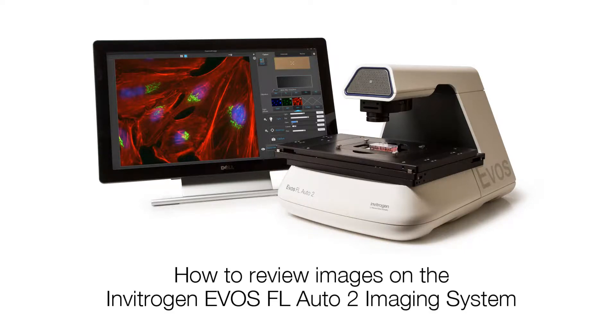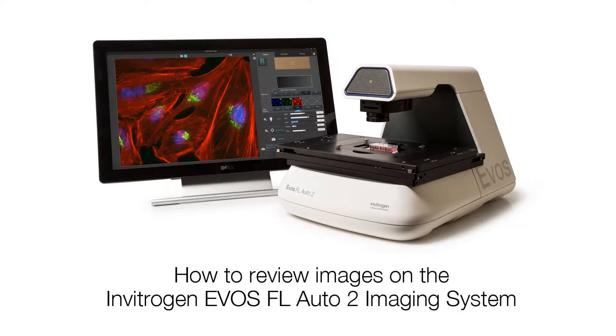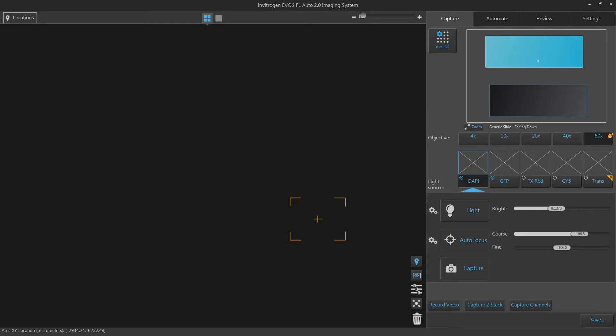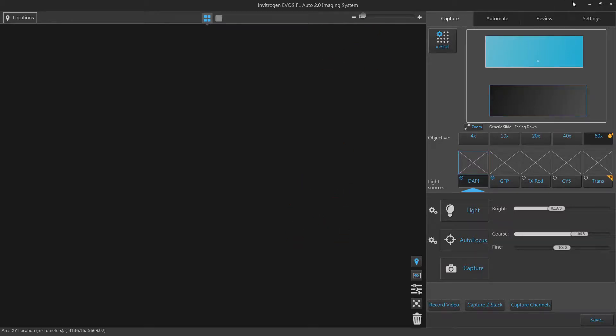In this video you will learn how to review images captured on your EVOS FL Auto 2 imaging system. The EVOS FL Auto 2 imaging system is capable of saving images from a single field, scan, time-lapse, and z-stack.